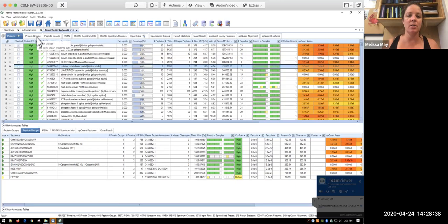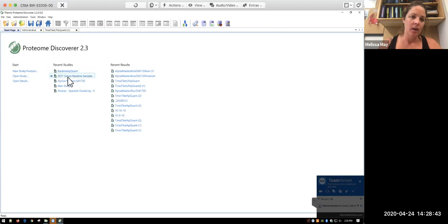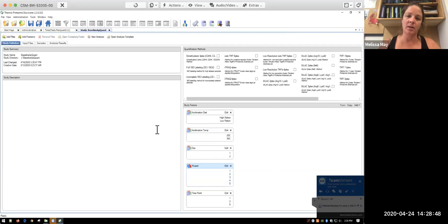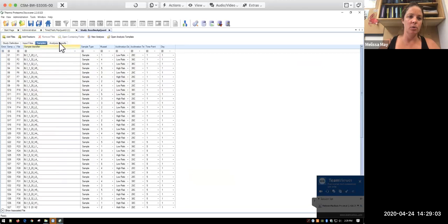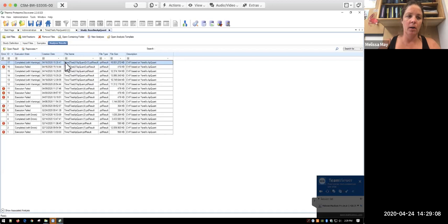So to get to this point, if you remember, we set up a study definition. And so in this, I was looking at my baseline app quant study. Again, I have all my study factors that are shown here. I have all of my various different input files that I've put in and then defined what different treatments there were using the samples tool. And then I have all of the different analysis results I've run for this particular study.